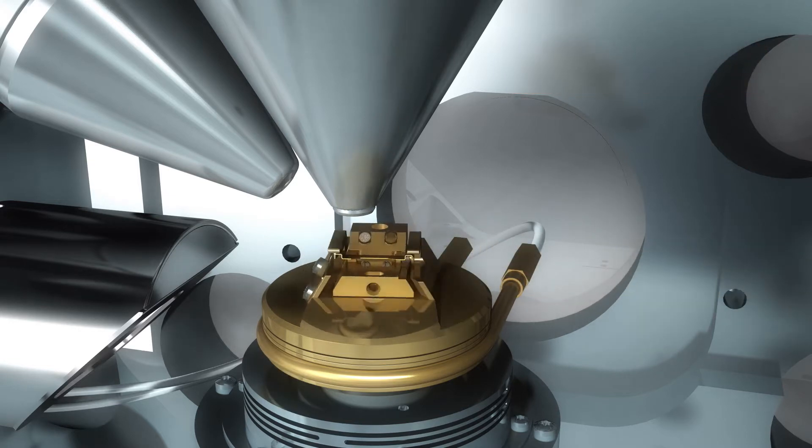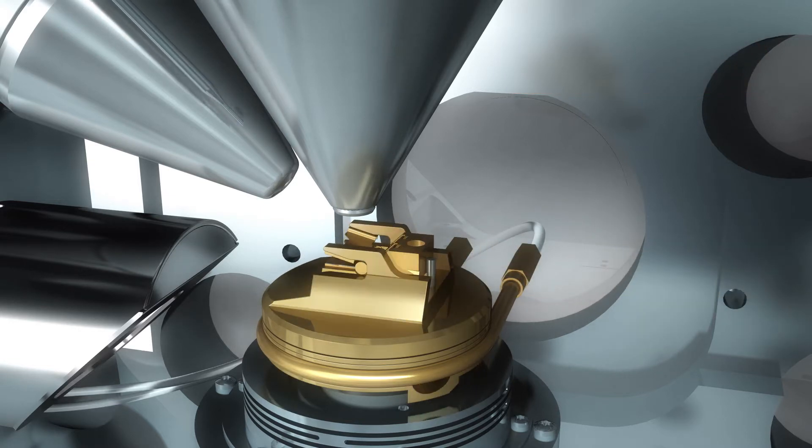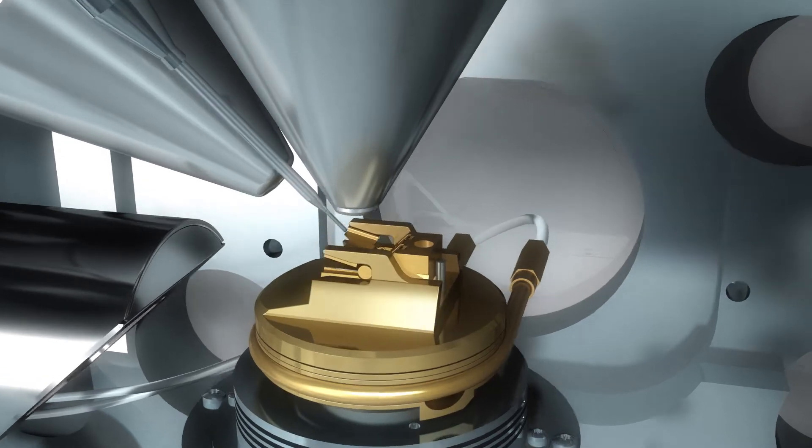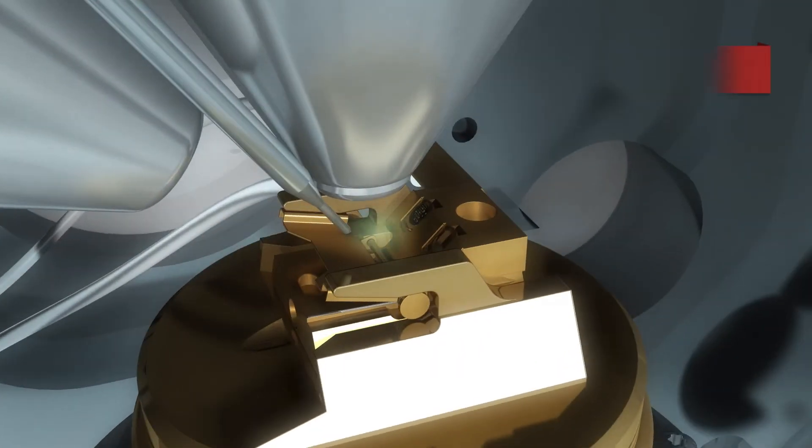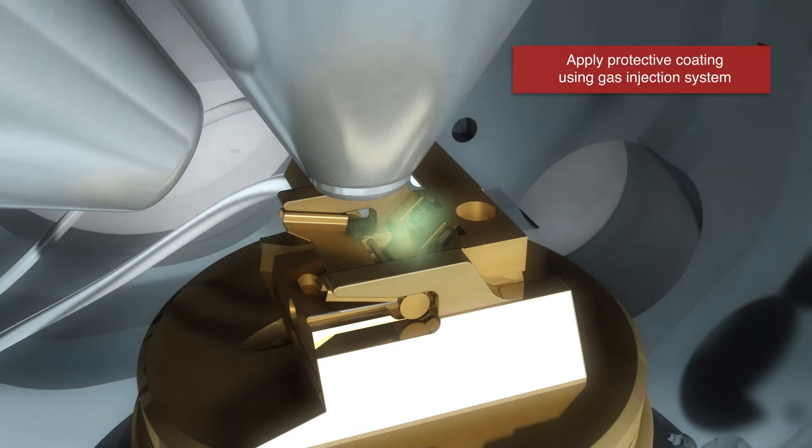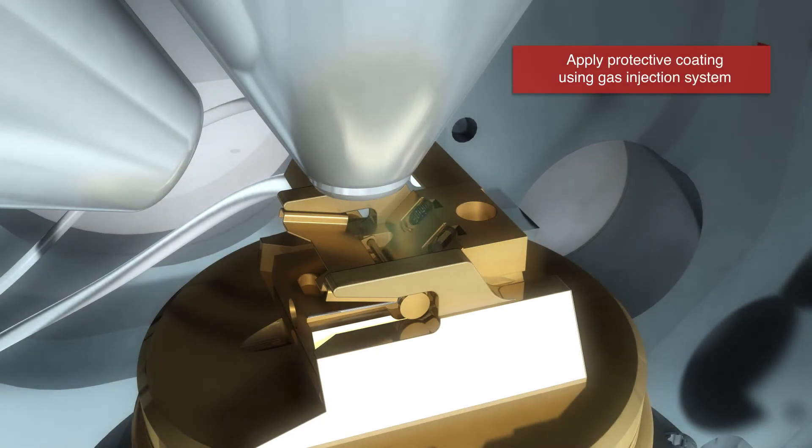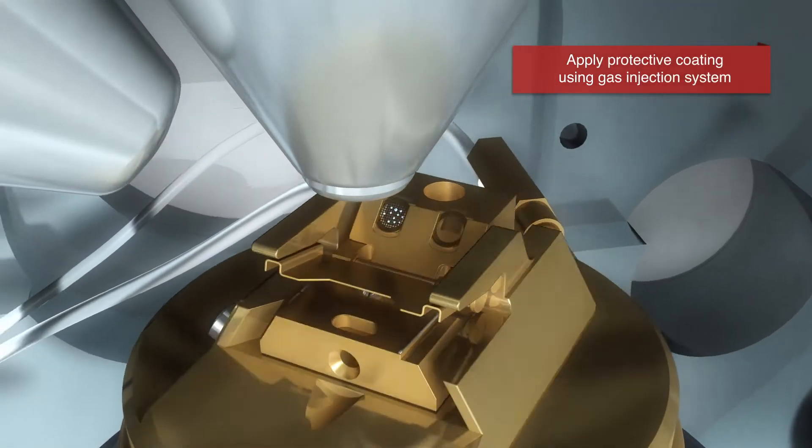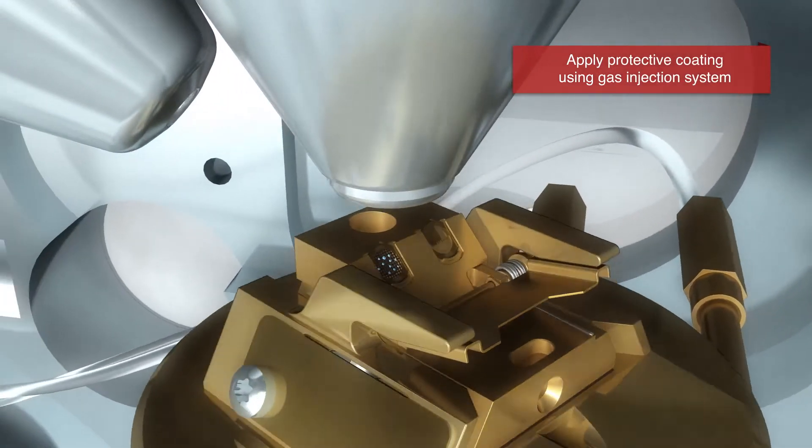Next, the stage is rotated and a gas injection system is used to apply a platinum layer, which protects the sample from ion beam erosion.